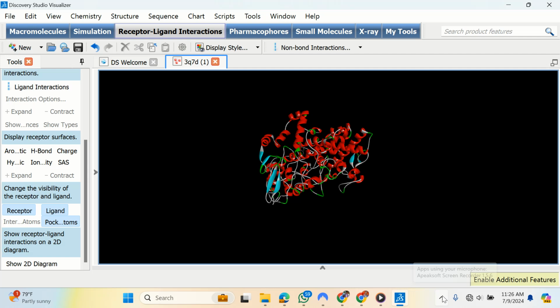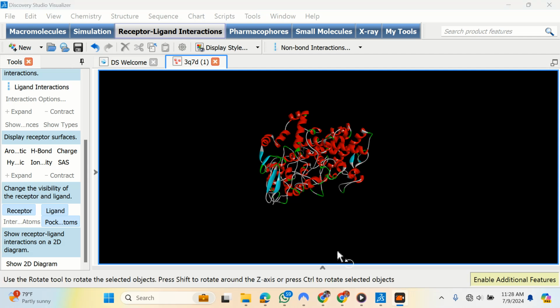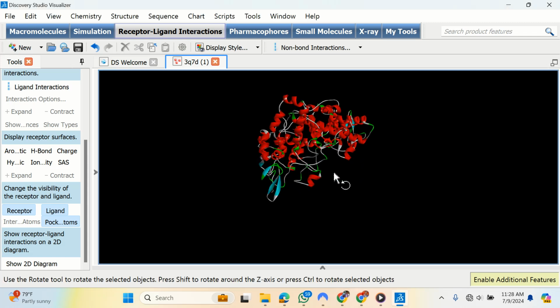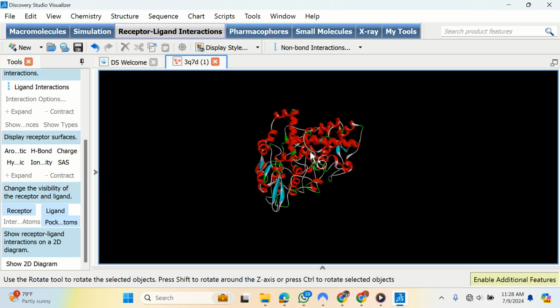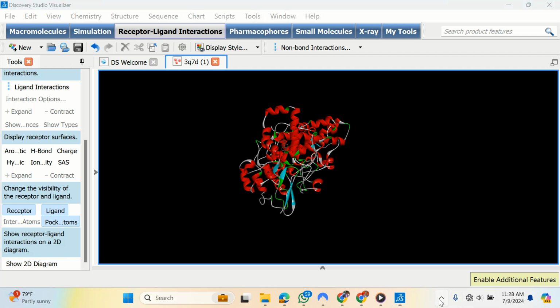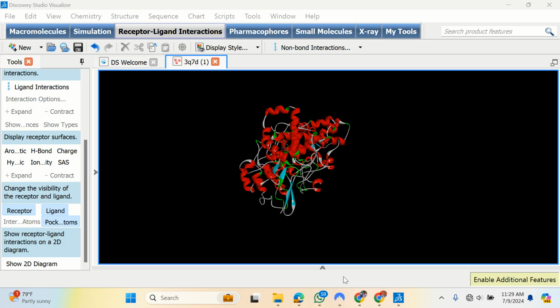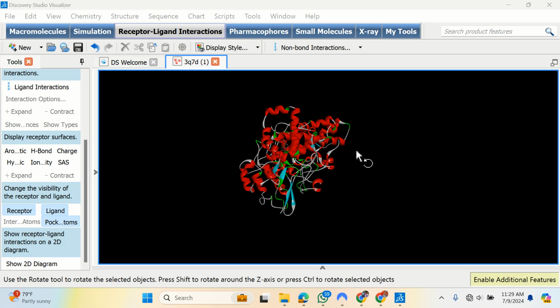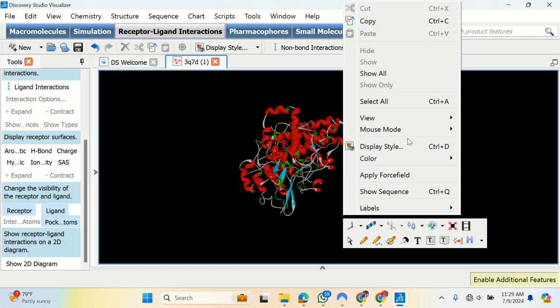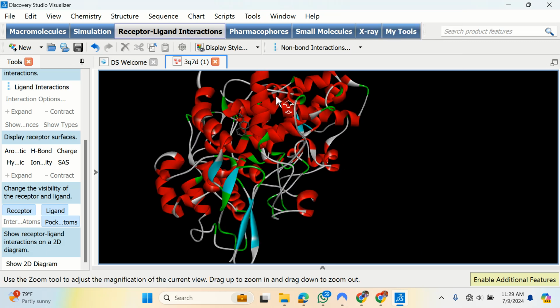We're going to start from where we ended yesterday. As you can see, this is our protein, and within the protein is the ligand. So we are continuing from where we stopped yesterday. This is our ligand, and this is our protein.